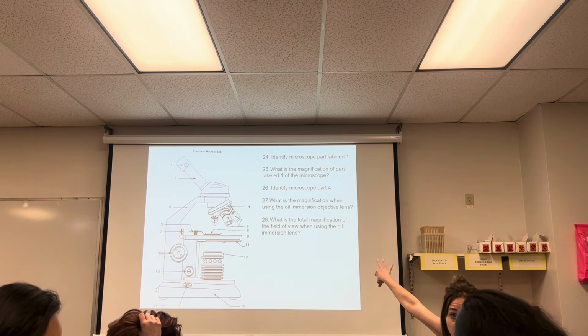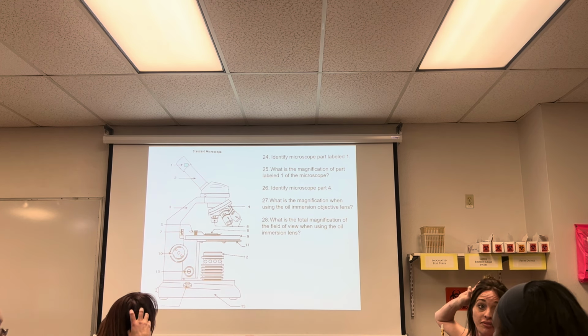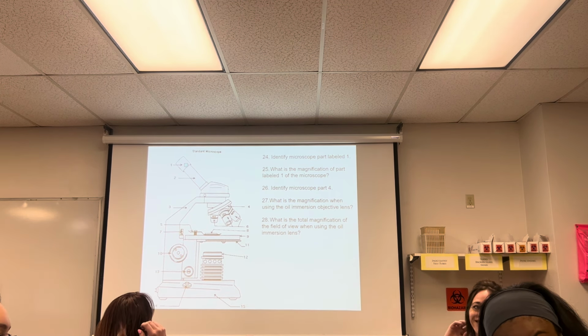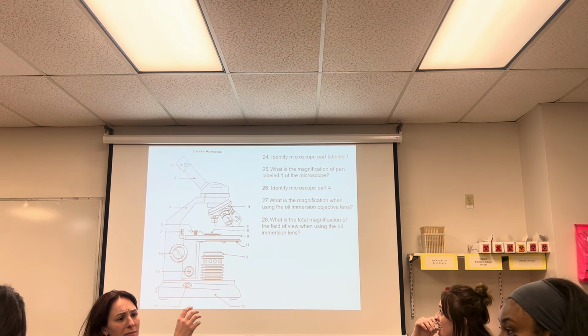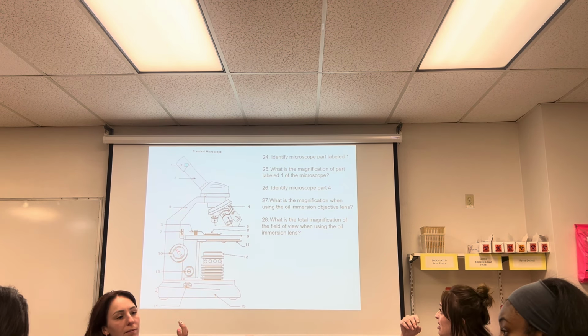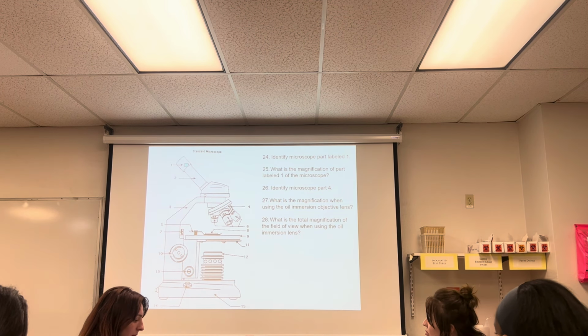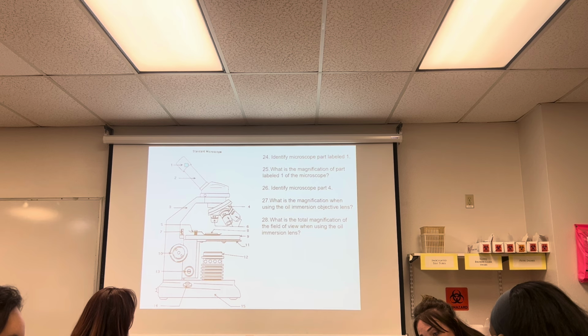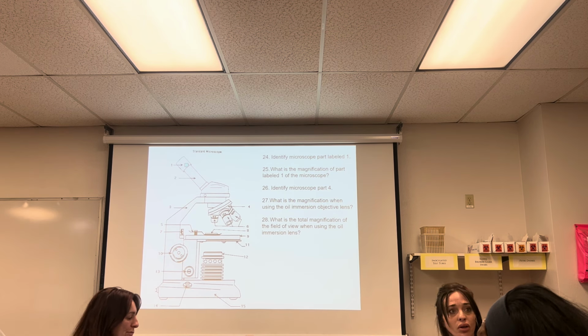The other two are these things right here. What is this little thing here? The dial. No. This little thing right here. Now, this is the big one, of course. This one is the fine adjustment. And you can't just say knob or dial. Fine adjustment is the small one, and the large one is the coarse.